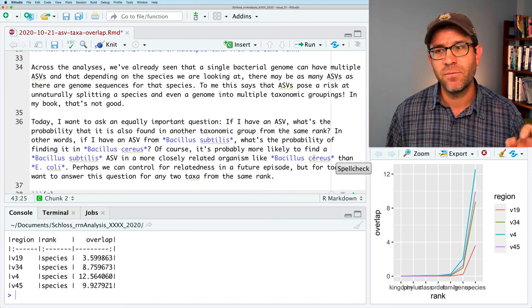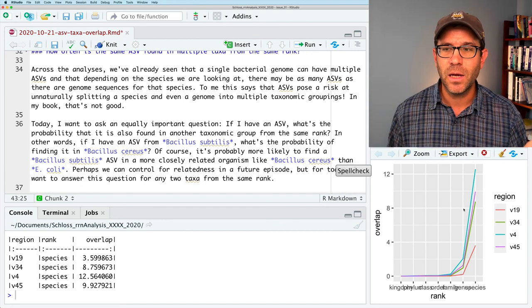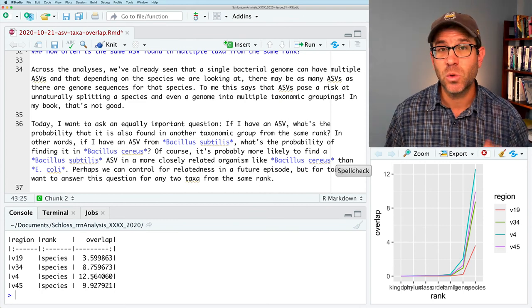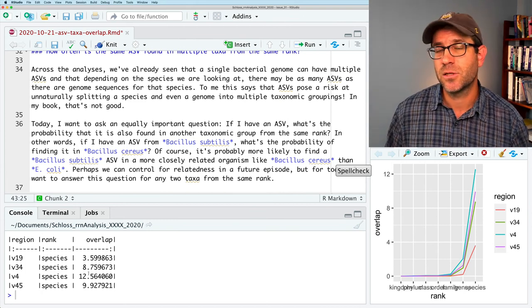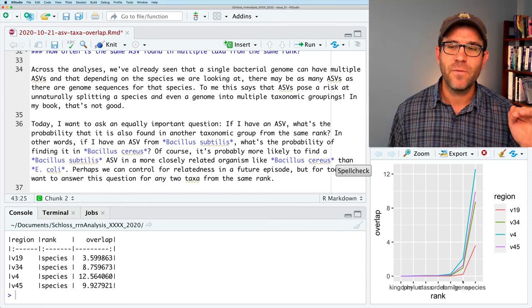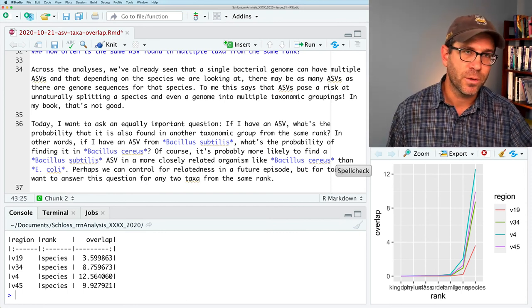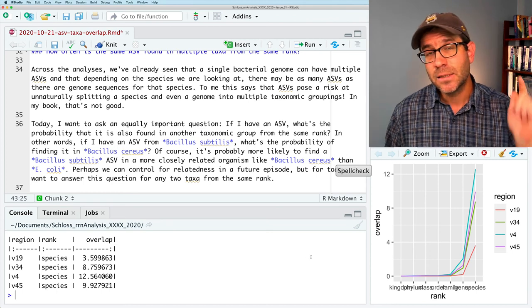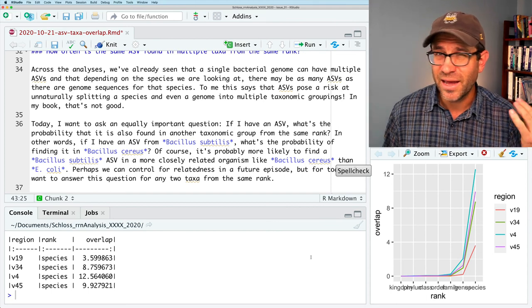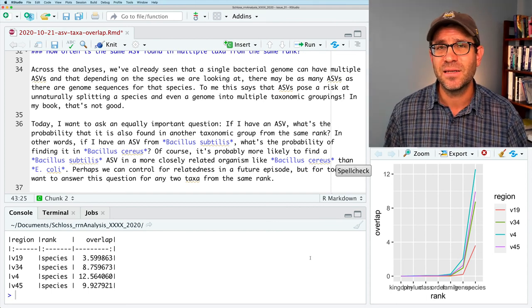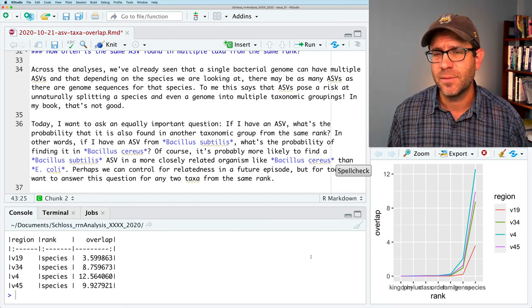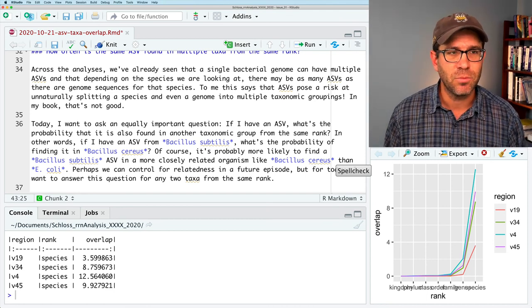Looking at subregions like V4, V3-4, and V4-5, we see between 8.8 and 12.6% of ASVs are found in multiple species. That number falls off as we go to genus, family, order, and up. But the problem with this analysis is that it uses all of the genomes. E. coli has something like 900 genomes in the database, whereas something else may only have one. So we'd like to control for that uneven sampling.